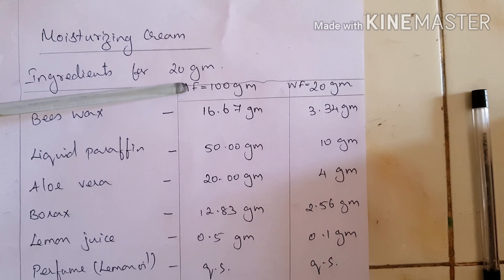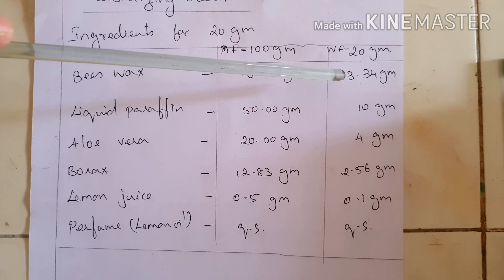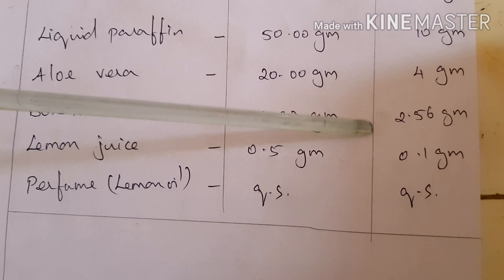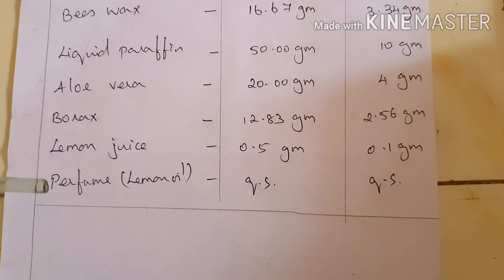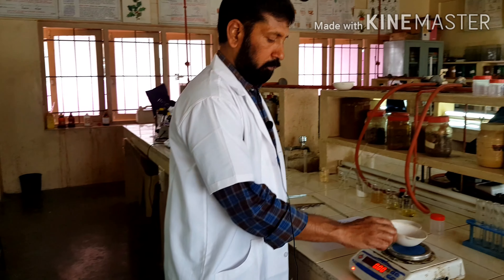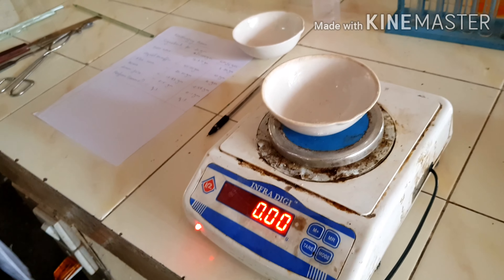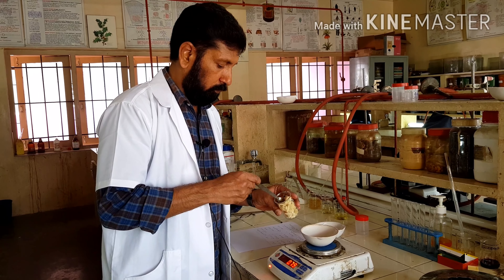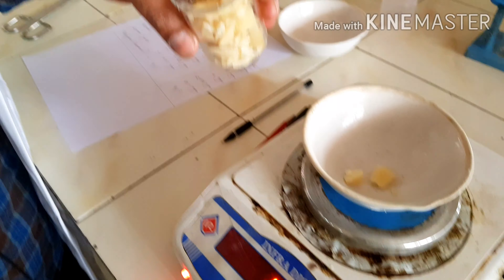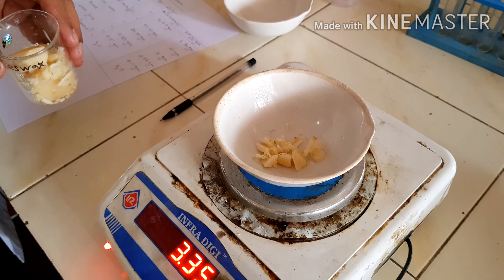The official formula is for 100 grams. Today we are going to prepare a working formula for 20 grams: beeswax 3.34 grams, liquid paraffin 10 grams, aloe vera extract 4 grams, borax 2.56 grams, lemon juice 0.1 grams, and lemon oil — quantity sufficient. Now we are adding 3.34 grams of beeswax.